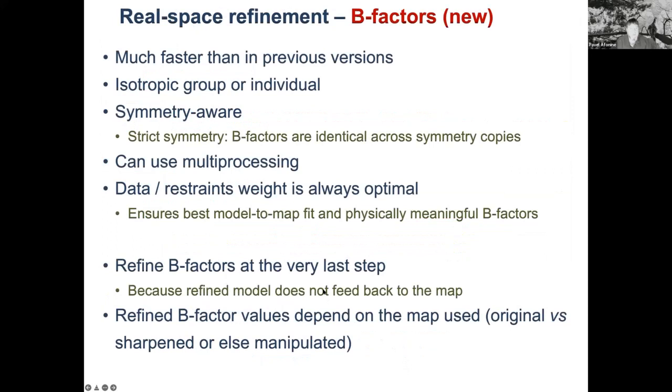All right, so these are the resources that I would like to mention, and now I'll just go quickly and tell you what's new. The first thing I'm going to mention is B-factor refinement in real space. In Phenix, real space refinement is the tool to refine atomic models against cryo-EM maps, or just generally maps. Up until recently, we've been missing an option to refine individual B factors.